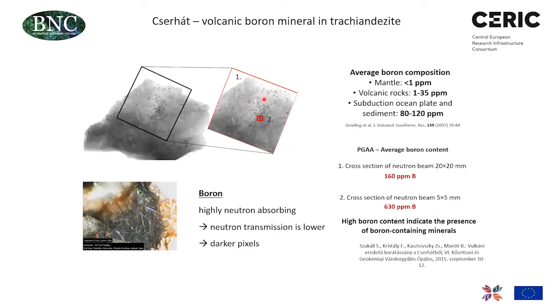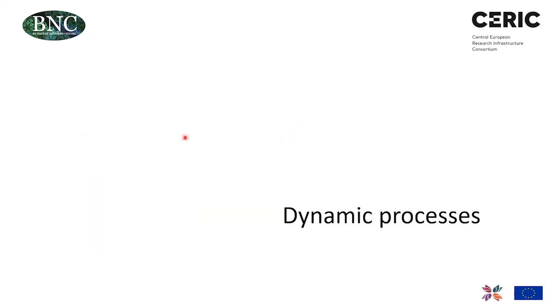Here we can also highlight some inclusions in geological materials. Sometimes we have local enrichment of certain components, and the wanted component is not distributed evenly all over the sample. We can also study dynamic processes.